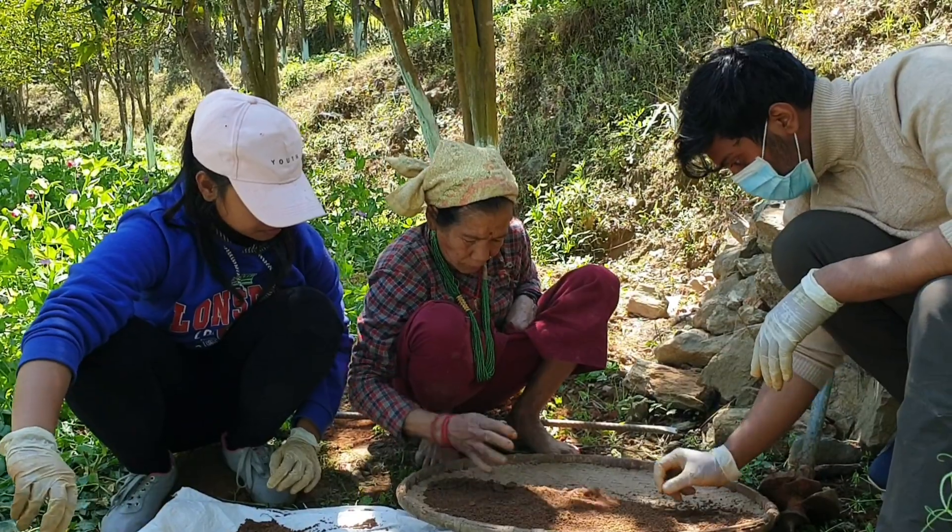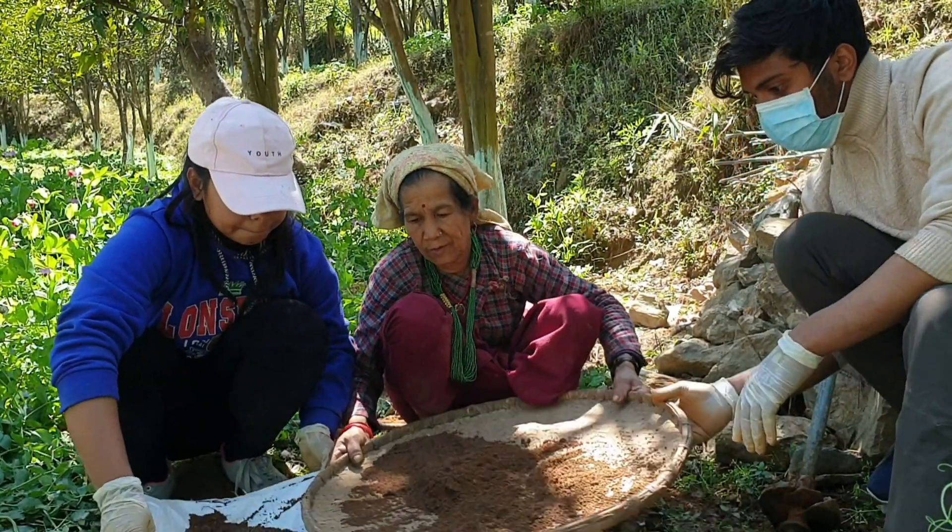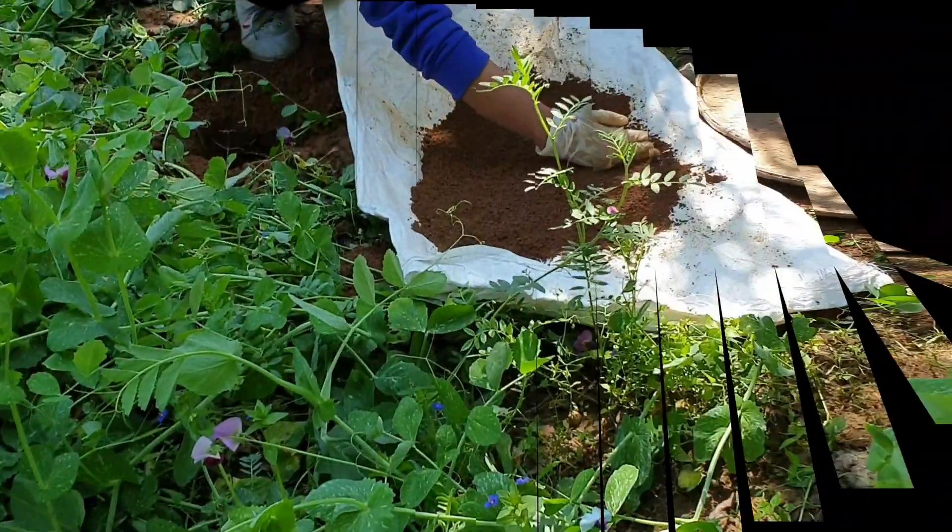Remove all kinds of debris present in the sample, such as stones, roots, plastic, and paper, as these may contaminate the sample.